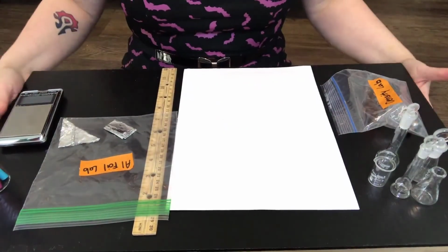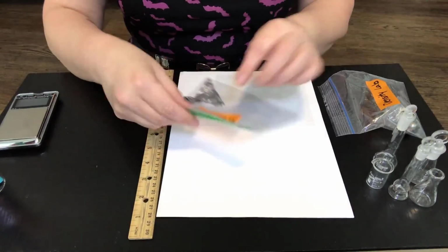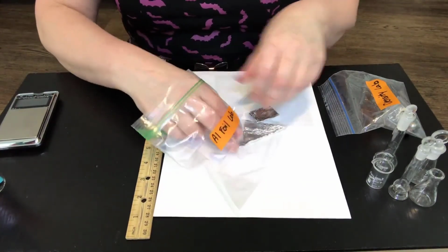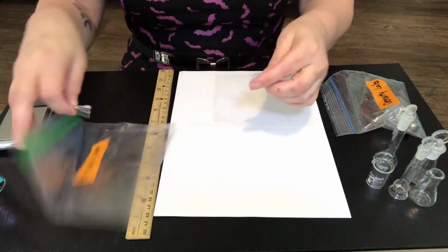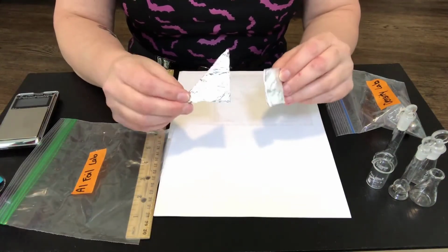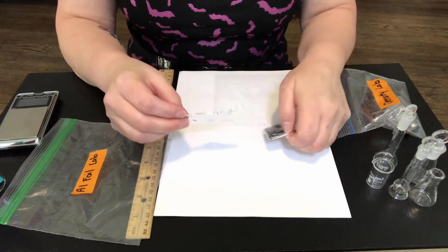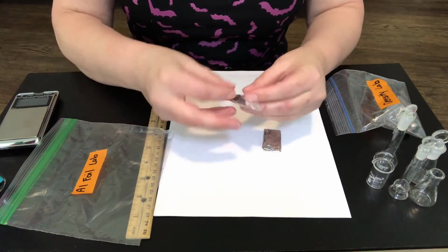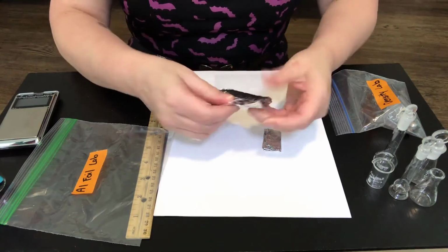All right, welcome back. In the lab that we performed last week, you had two pieces of aluminum foil, and we folded them up into two different shapes just so that we could keep track of which piece of aluminum foil we were collecting data from.